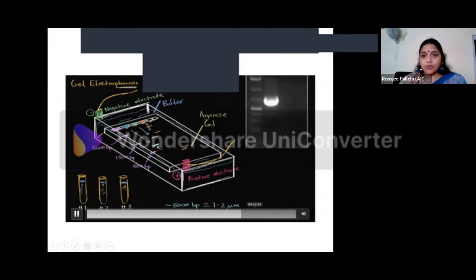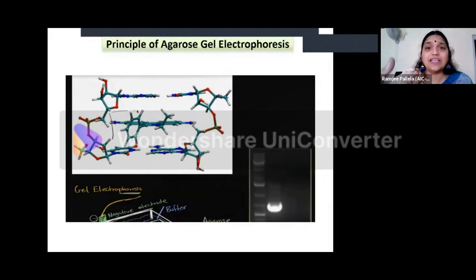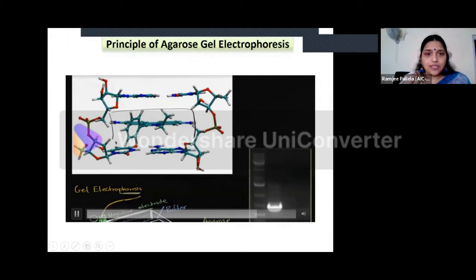Okay. Now you see here, what is this? This is an intercalating dye, the ethidium bromide. Okay, yesterday ma'am also told you that we use ethidium bromide to actually check how much the gel has run, and the fluorescence that is coming out of it is actually because of the ethidium bromide. What ethidium bromide does is, if you can see here in the middle, this one, this is nothing but the structure of ethidium bromide.